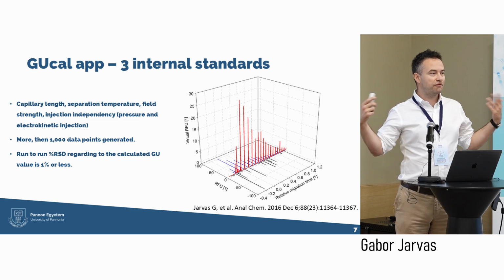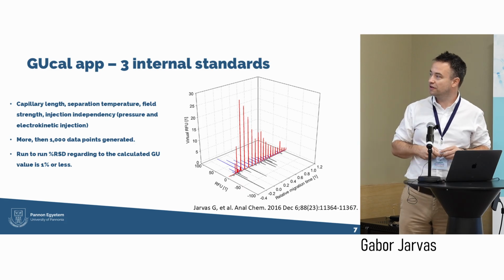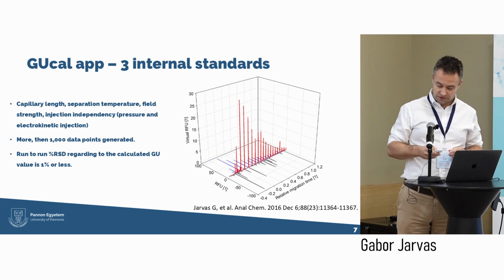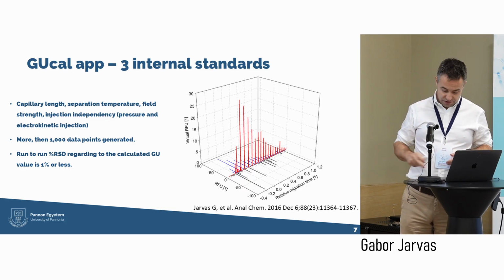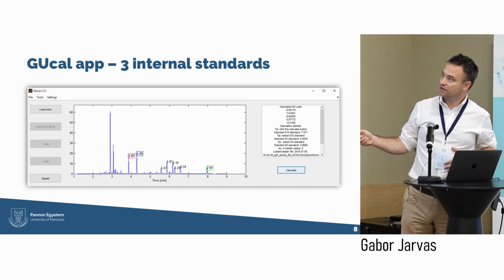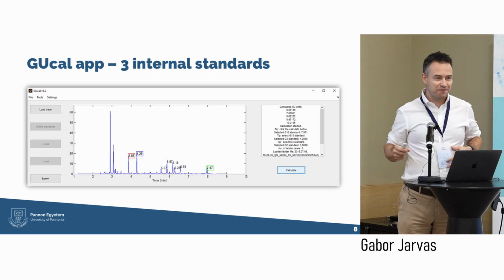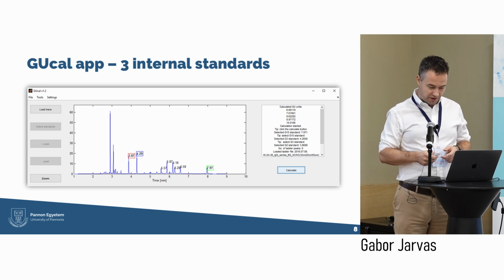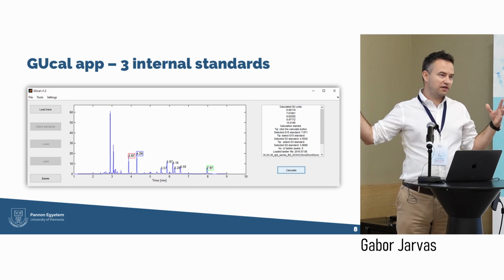Why? Because you do not have to run a separate ladder to get accurate information on the CE-based structural elucidation. We have implemented this approach in an app as well. So it's much simpler because it misses the ladder part. And yeah, that took us more than 7 years.